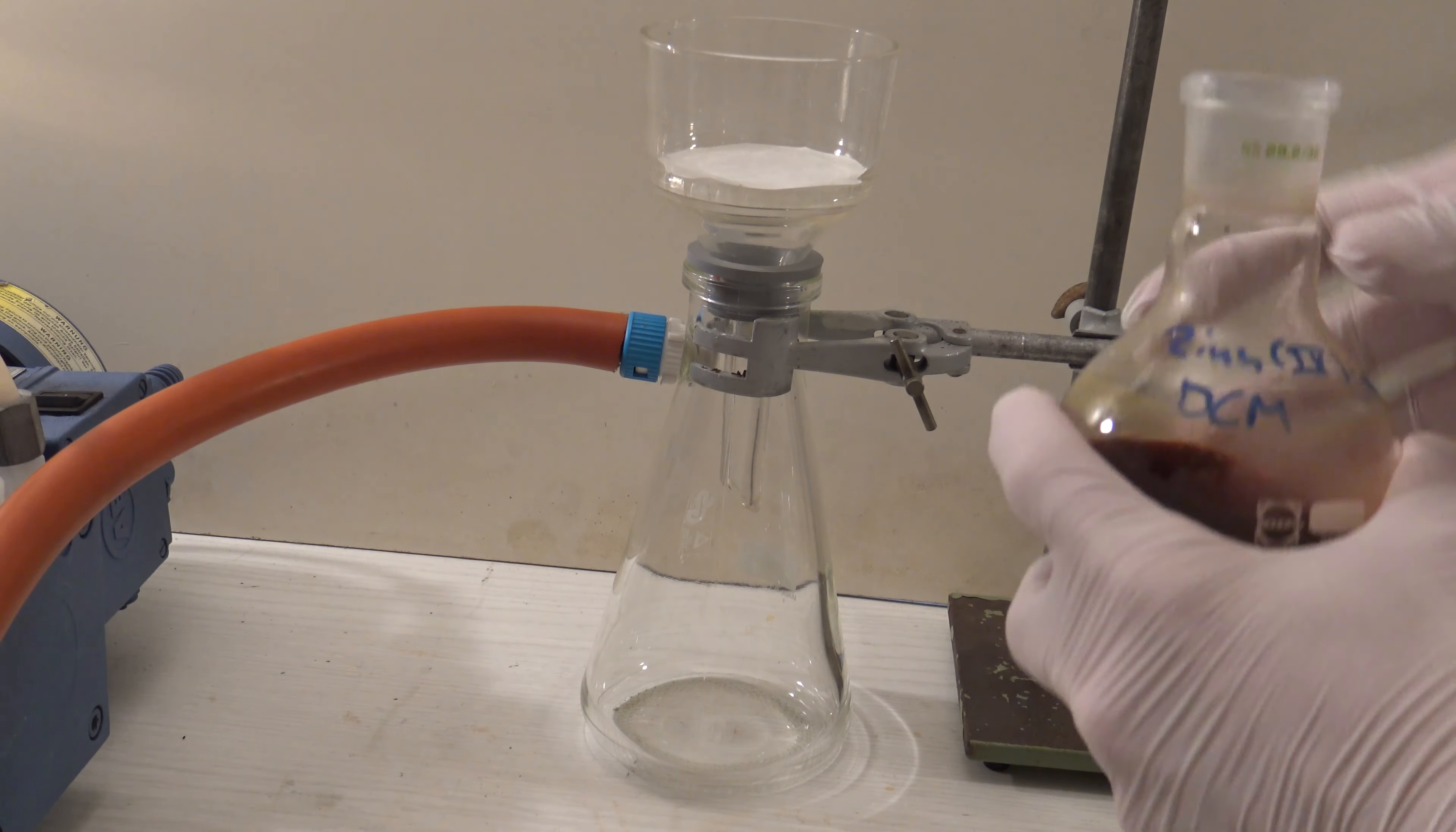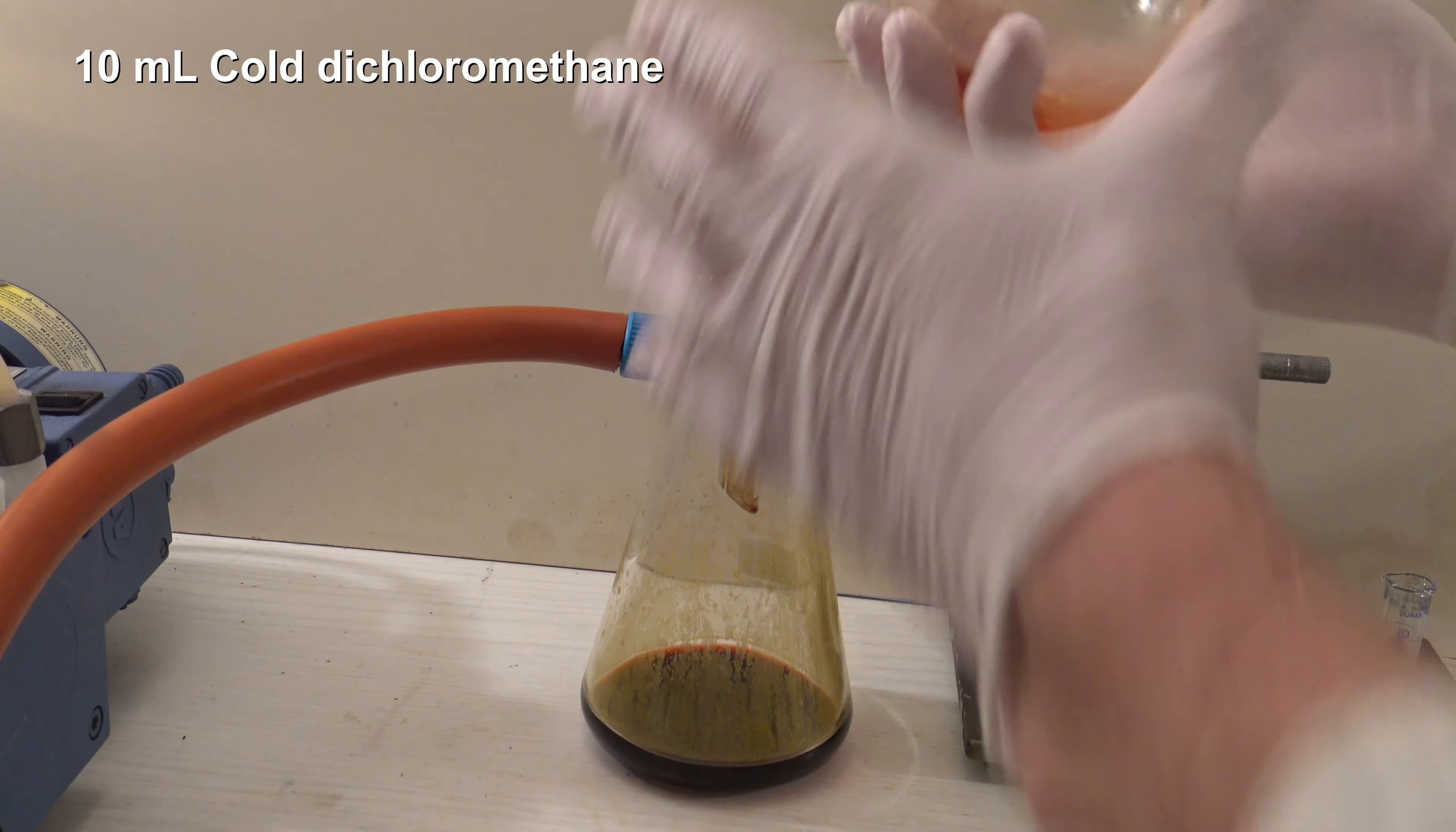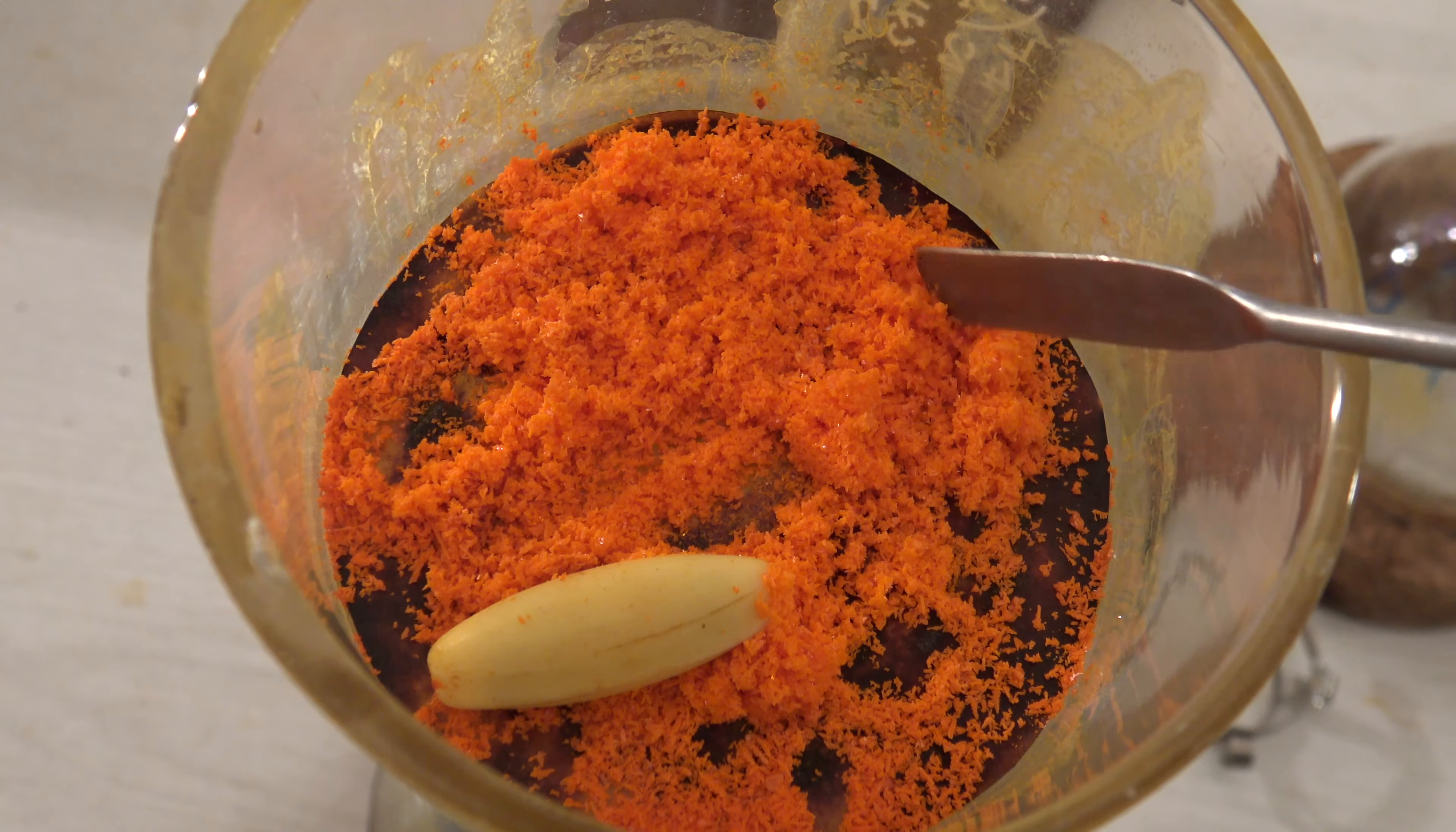This helps to prevent the solution from heating up again and causing a part of the product to redissolve. Then 10 milliliters of cold dichloromethane were used in small portions to wash out the residual product. Beautiful crystals of tin(IV) iodide were obtained. The filter paper was stained by the residual iodine.